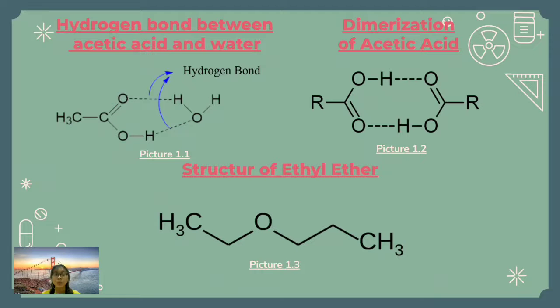In the acetic acid and water layer, more acetic acid was obtained than in the layer of ethyl ether and acetic acid. This is due to dissociation, which forms hydrogen bonds between acetic acid and water, where the presence of these hydrogen bonds is very strong and increases its solubility. That's why the amount of acetic acid is greater along with water. Hydrogen bonds are very strong because the H+ ion, which has lower electronegativity, bonds with free electrons from oxygen, which has higher electronegativity. So the more free electrons in oxygen, the more it increases the attraction of cations such as H+ to bond with it.